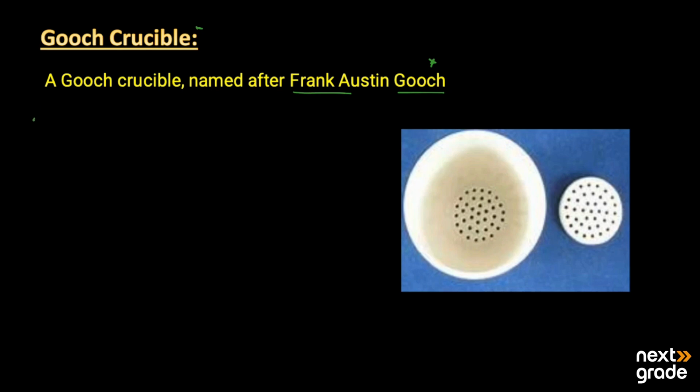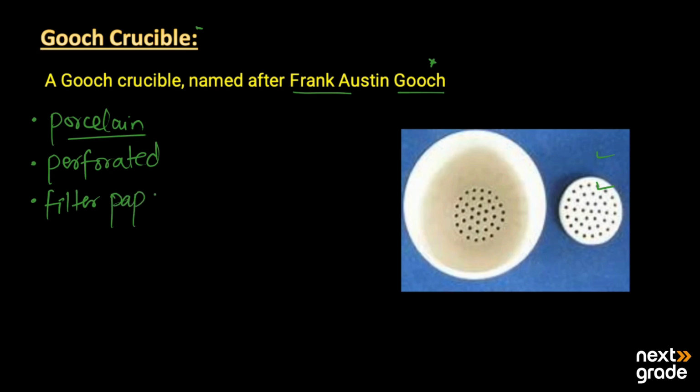Mainly, the Gooch crucible is made up of porcelain. The second property is that it has a perforated bottom. Its bottom is perforated, and it is also covered with filter paper. The bottom is covered with the filter paper. So mainly these are the three properties of the Gooch crucible.